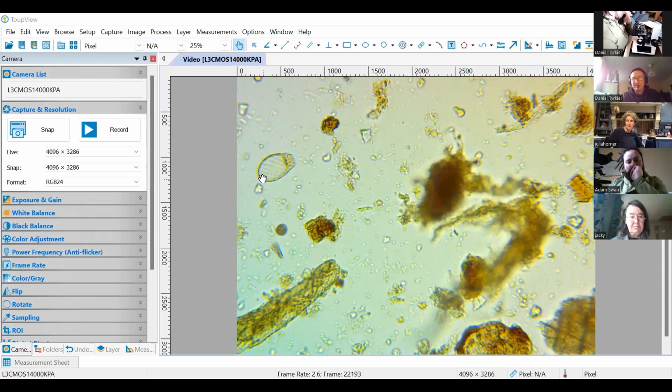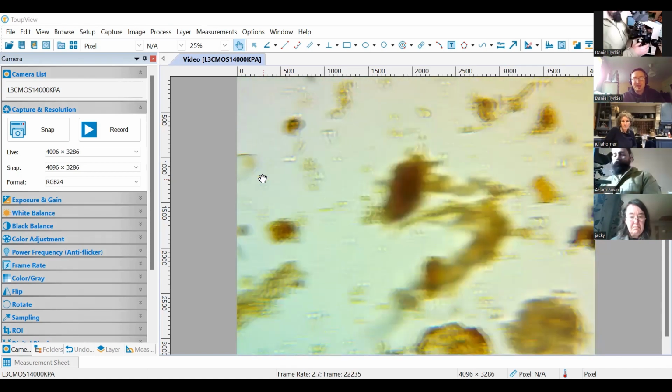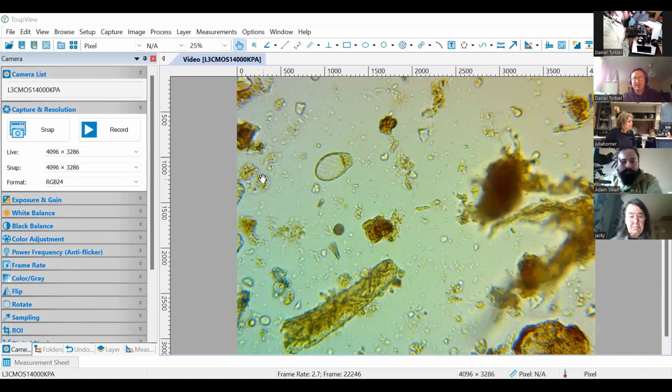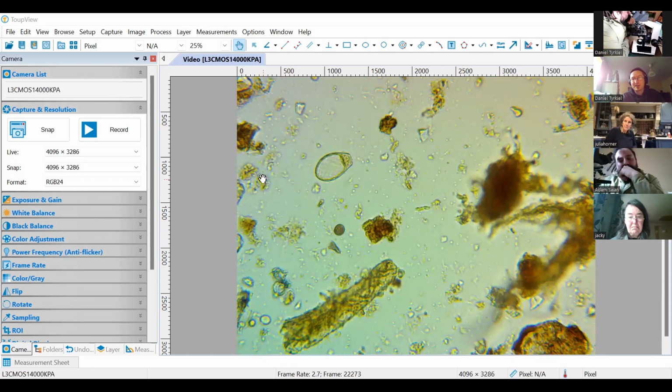The naked amoebae, we rarely see them in regular compost, but you can make an experiment. You can take compost and wet it out. When you keep wet compost for a few days, and you could also add some milled fresh greens into the compost, keep it wet, and after a while you would have a plethora of pond organisms, and that includes very large naked amoebae as well.